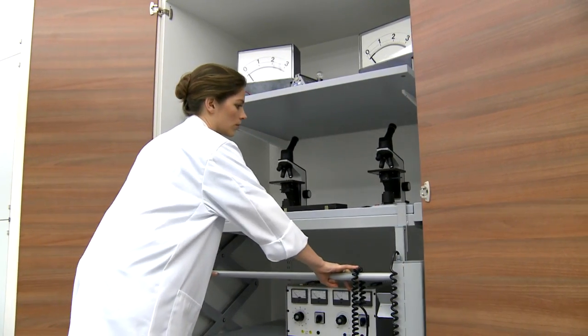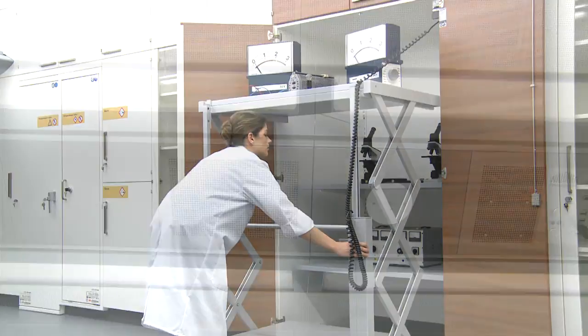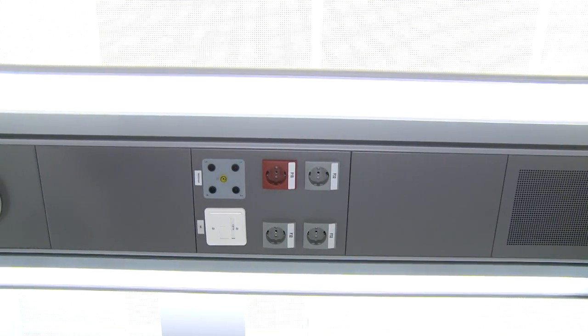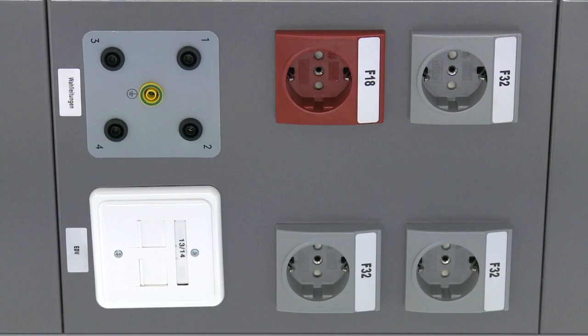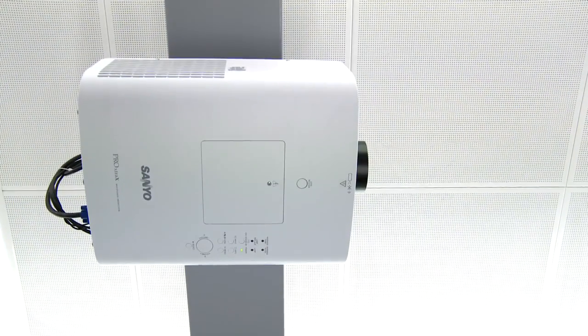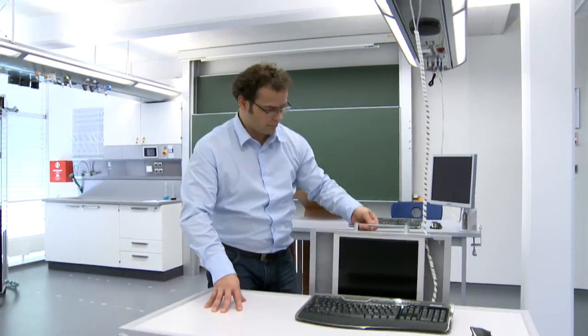You will be won over by the details of our intelligent solutions for barrier-free subject teaching, as well as the utmost levels of flexibility offered by multifunctional rooms that can be converted for different teaching formats within a short time. You can offer more than seven different subjects with only one furnishing concept.